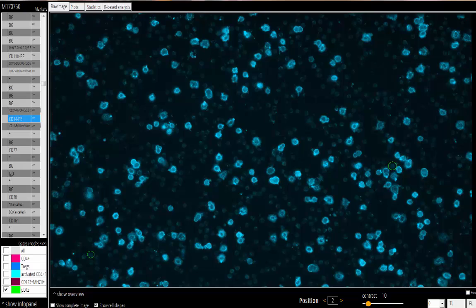When doing this, you don't need to worry about spillover, because the detection channels are designed in such a way that almost no spillover takes place, so there is also no need for compensation. This means that developing a multicolor cocktail for Chipcytometry is much faster than for flow cytometry. You just need to find the right clones with the right colors, mix them together and put them onto the chip.